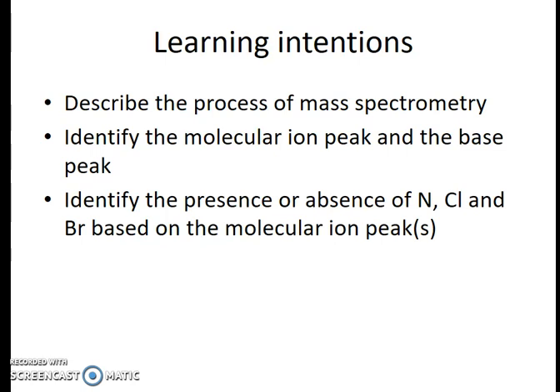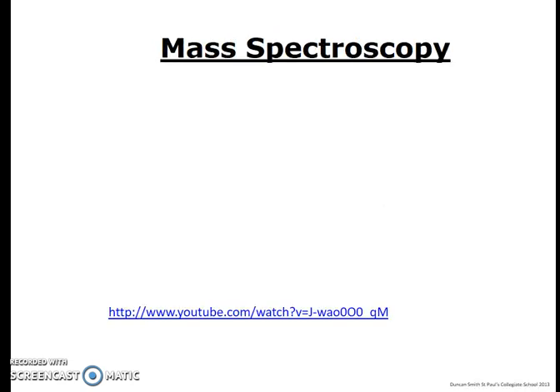Today we're going to be looking at mass spectrometry and some of the basics of how that works, and how we can identify the molecular ion peak and use that in our spectral analysis. So first, a little bit about mass spectrometry.